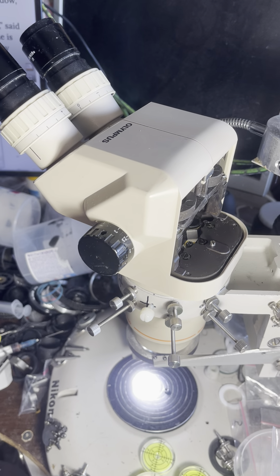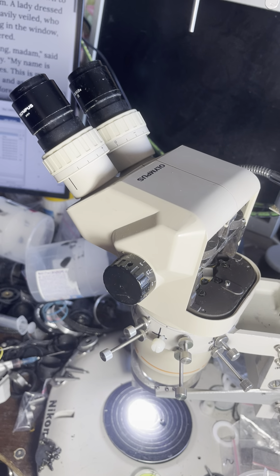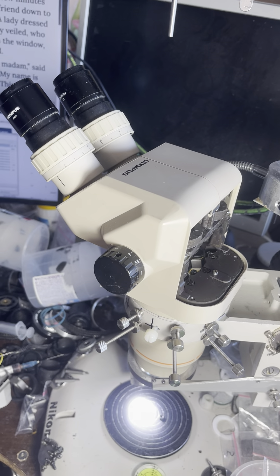Here's the Olympus SZ 60-45 microscope, and this time we're about to try to attach a photo splitter — but not the usual kind. I've changed it to be 50-50 for the right channel instead of the usual 100% / 0% configuration.